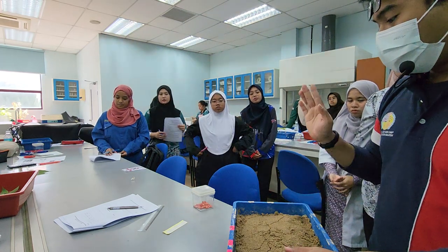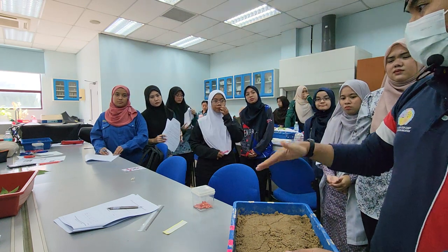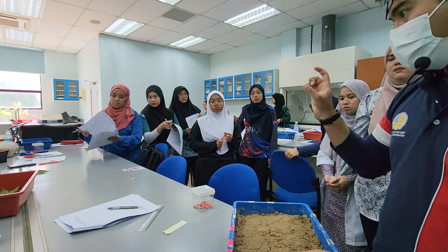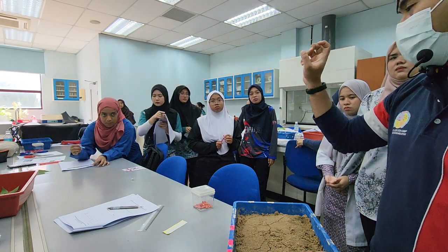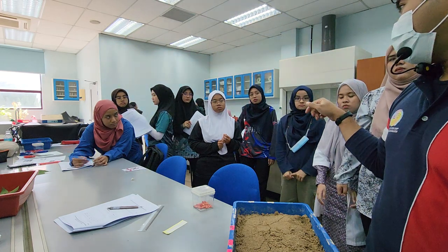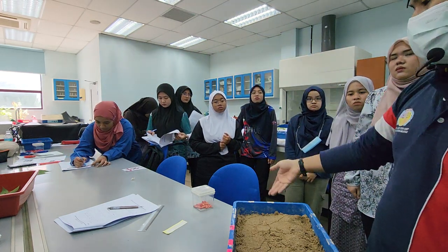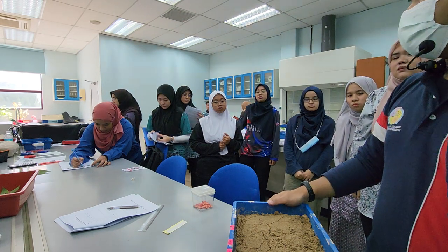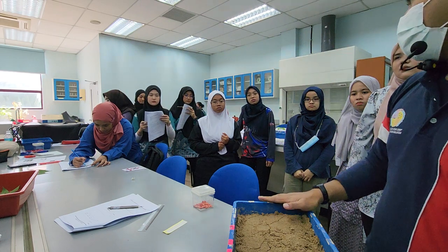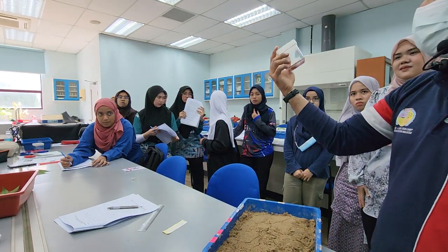The idea is you need to grow this for a few weeks. Each week, after the seeds have germinated, you're going to harvest the seedlings, and then get the fresh weight and the dry weight of it, for 2 or 3 consecutive weeks. Remember the formula that you saw on Monday, it requires T1, T2. Okay? So the seeds that you're going to use, what is all this?